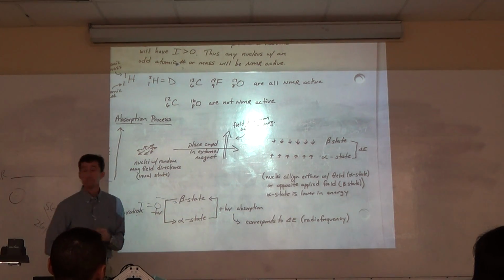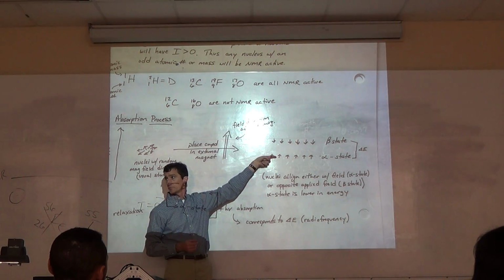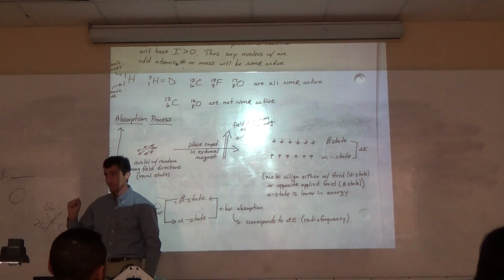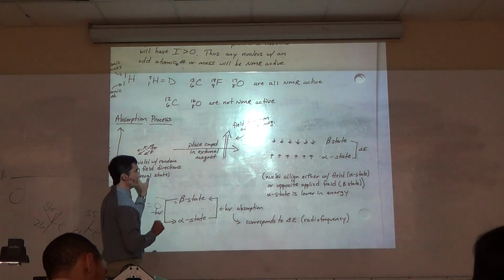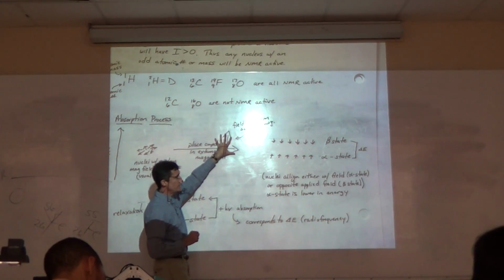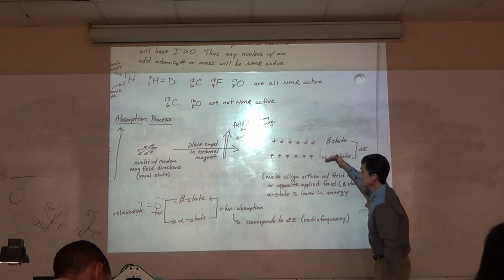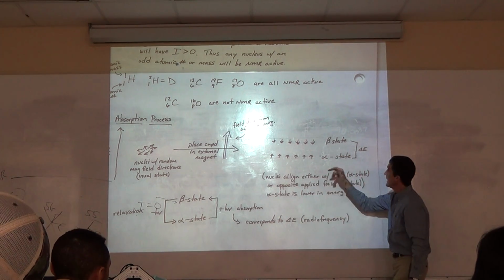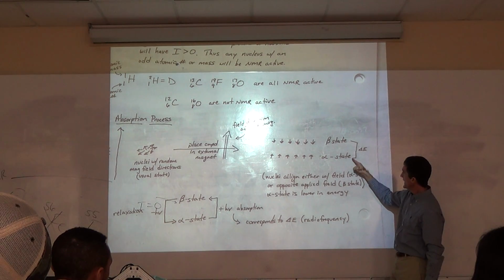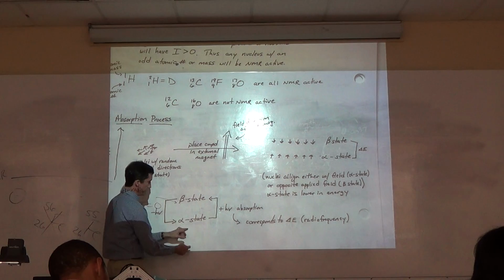Do we know why? Well, because this is lower in energy, and that's just favorable, and it's more favorable, but only a wee bit. Okay? Not highly favorable. What the external magnet does is give you 2 discrete energy states now, where over there you didn't have any discrete energy states. Now we can put energy in, right here I'll show you that.